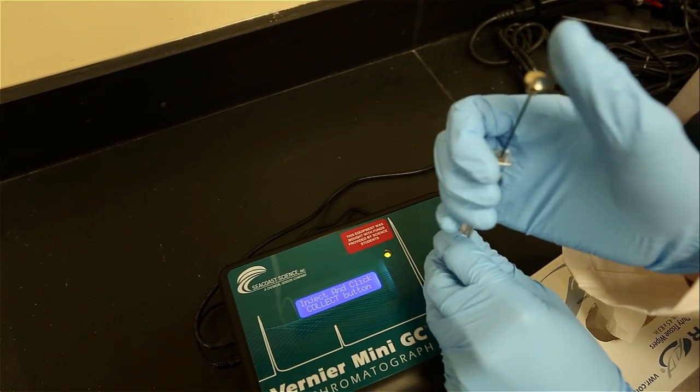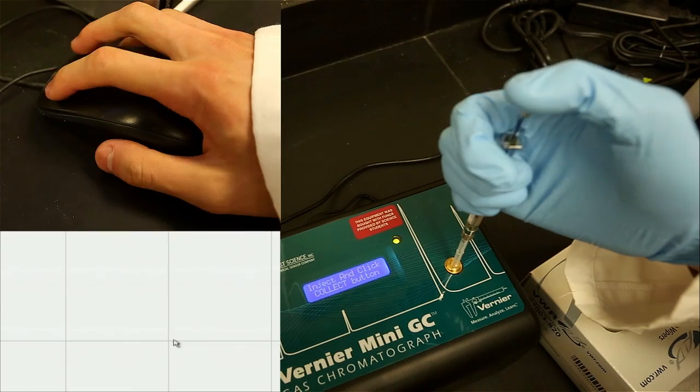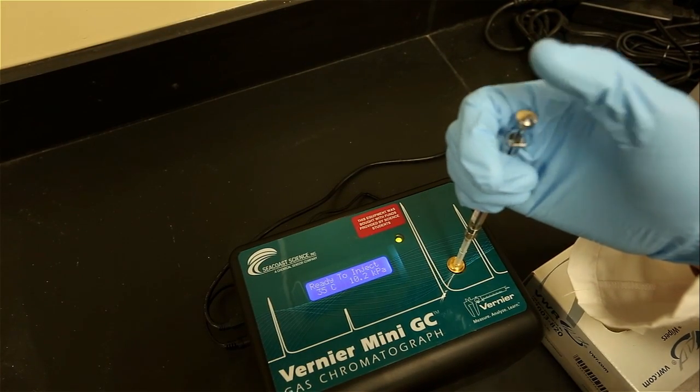When you are ready, simultaneously depress the plunger and click the collect button to begin data collection. Pull the needle out immediately afterwards.